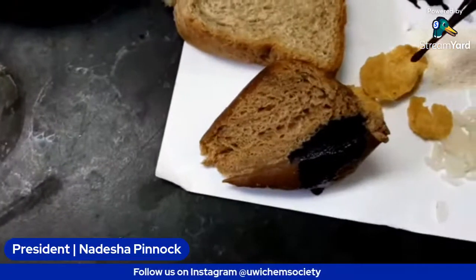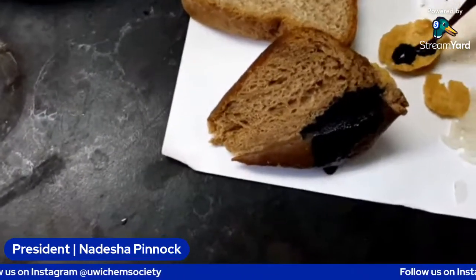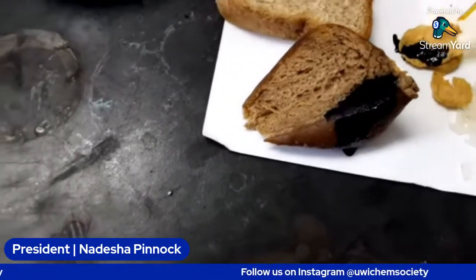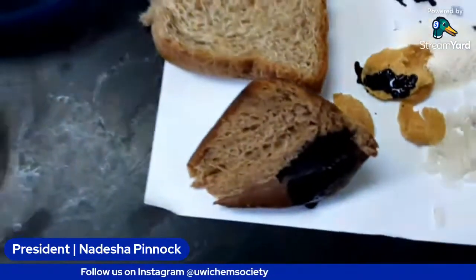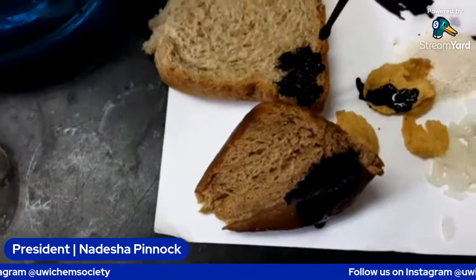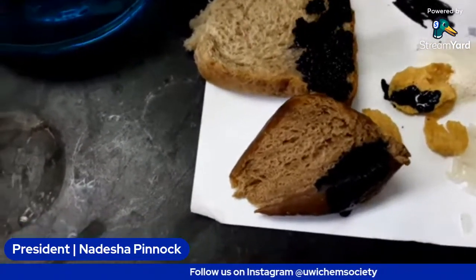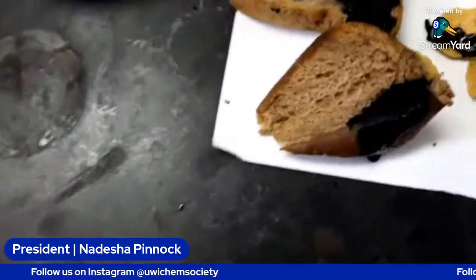Then we're going to do the cornflakes, which has corn in it, so you expect it to have some starch. You can see the same blue-black, and we're going to add it to the bread. And of course, we're seeing the blue-black color on the bread. So that's pretty much the starch test.